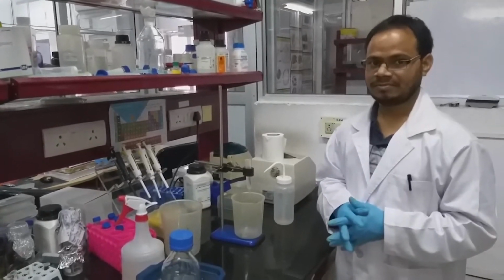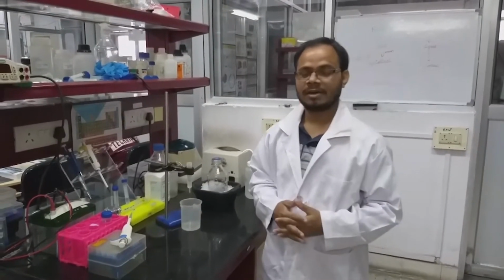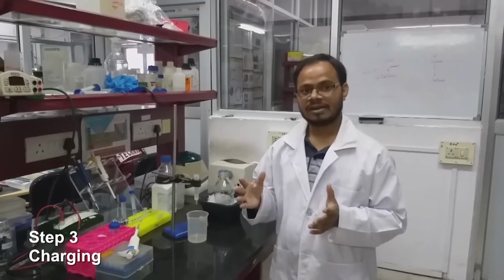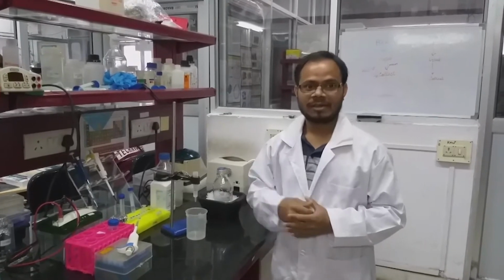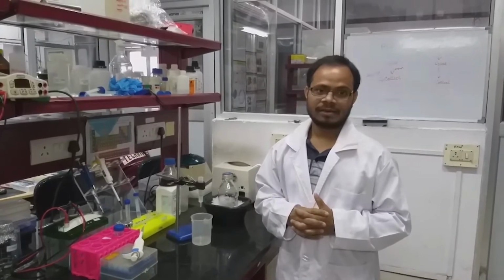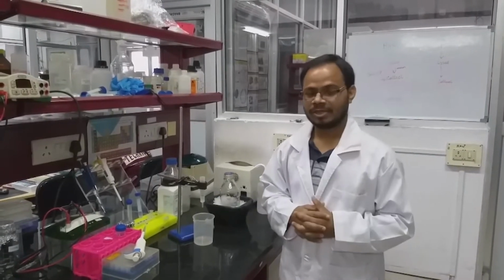bacterial cells. Before equilibration of the column, we have to charge the column. For nickel NTA, there are two types of beads. One is already readily charged beads which come from the company, and another one is where we have to charge them. They will give only NTA agarose beads.